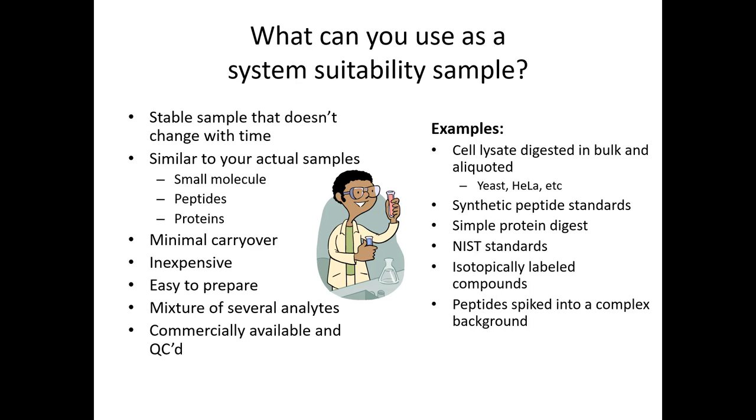Yeah, okay, so the stability of the HeLa lysate digest is quite good as long as it's above a certain concentration. That is the most obvious effect related to stability: if you have a sample that is very dilute in an autosampler vial, like a peptide mixture or even HeLa lysate, you will lose some of these low concentration peptides to the autosampler vial.